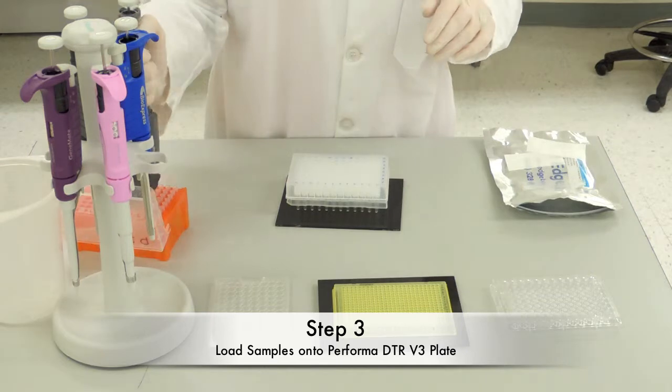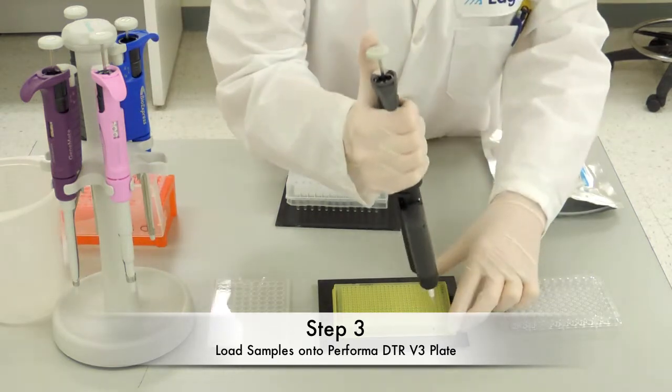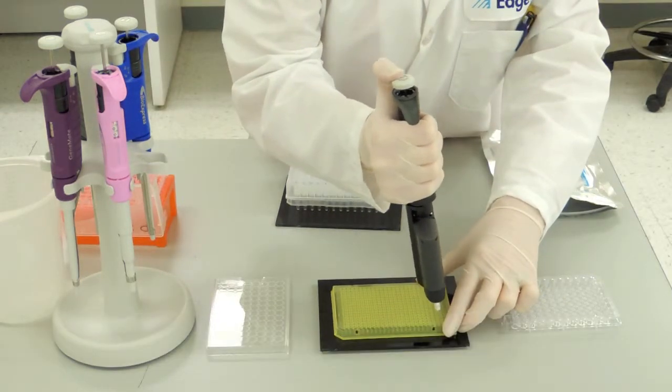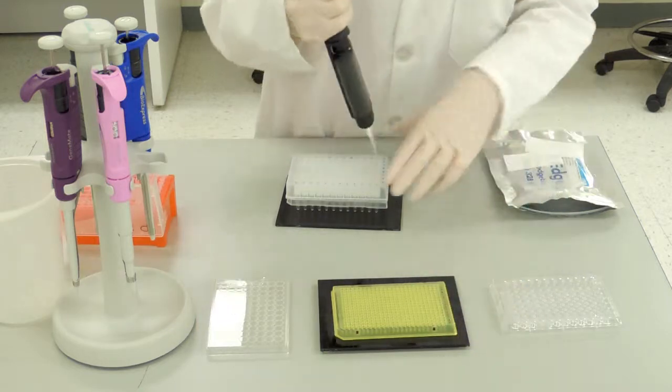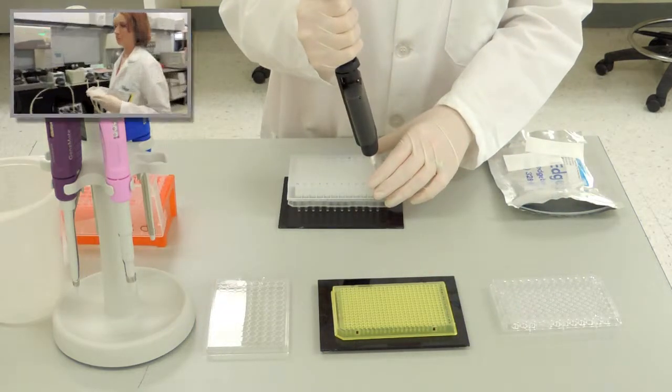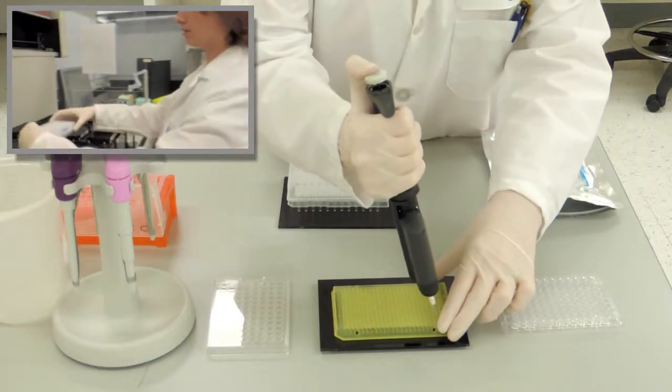At this point, there are several methods for loading your sample onto the gel. This can be done manually with a multi or single channel pipette, or robotically with a programmed Biomek machine.